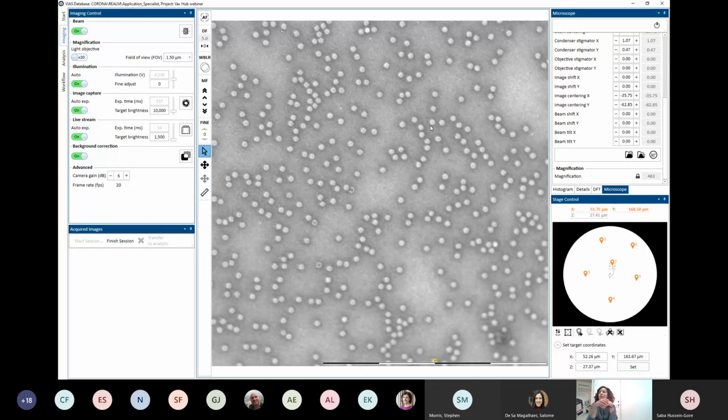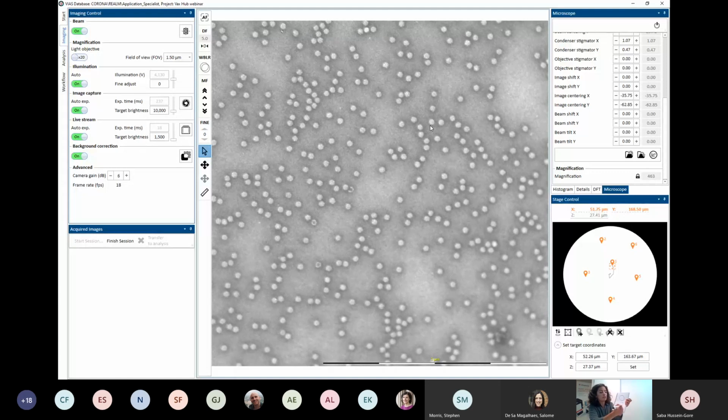So we use the stain when we are staining our samples. Particles that are broken are not intact. The stain will seep inside, and we will end up seeing something that has a dark center. So in this instance, we can classify AAV particles as internally stained, meaning it's broken and the stain has come in, and internally non-stained, and these are intact.